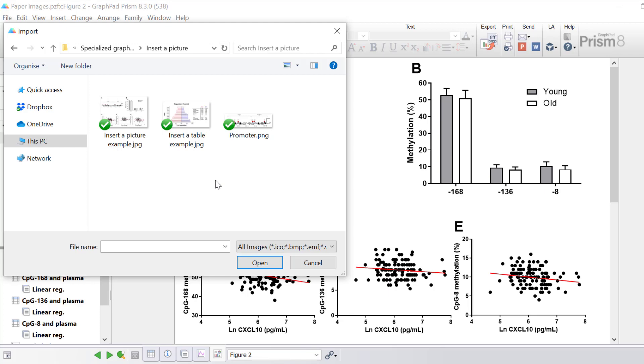If you are using Prism Mac you can import TIFF, BMP, JPEG, PCT or Macintosh PICT, PNG and PDF files.